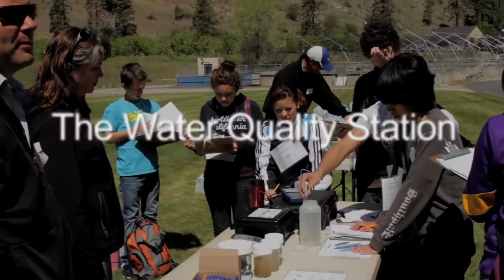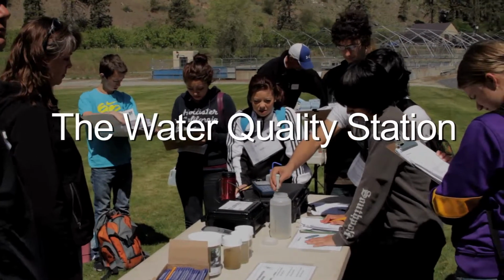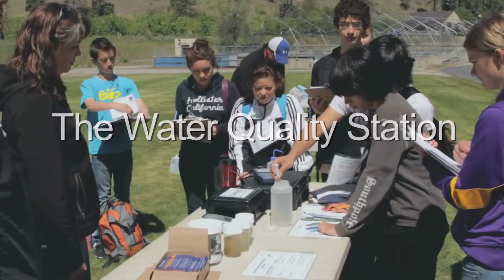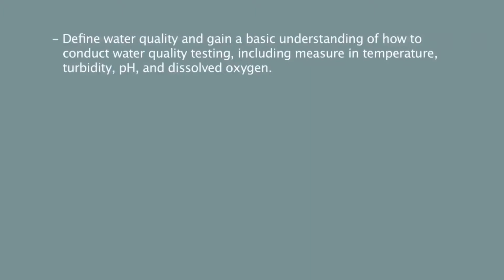This video is going to help guide you through the process of hosting the Water Quality Station. The objectives of the Water Quality Station are to define water quality and gain a basic understanding of how to conduct water quality testing, including measuring temperature, turbidity, pH, and dissolved oxygen.